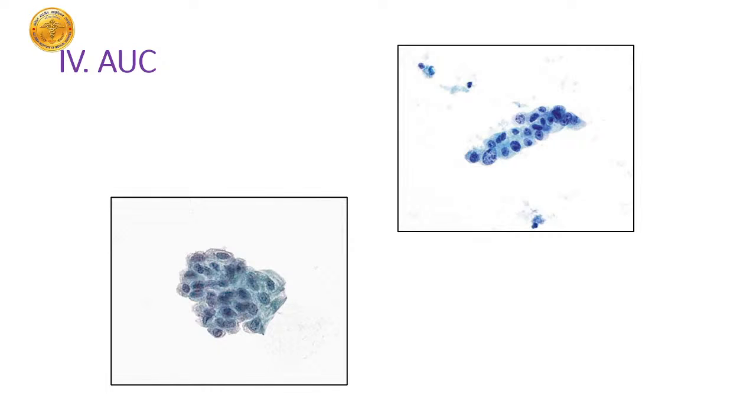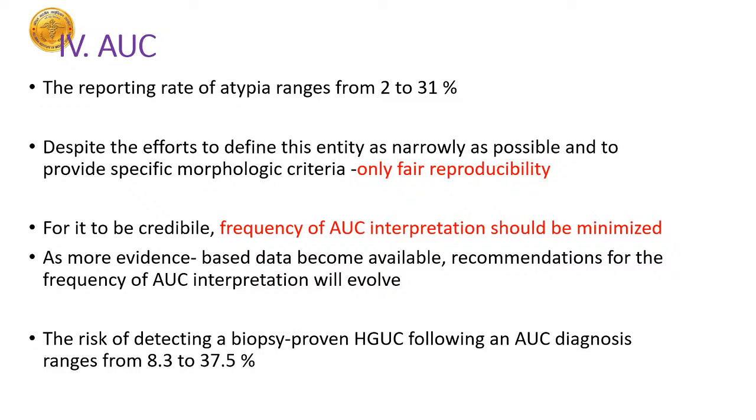Right, this is just to show you a specimen of degenerated urothelial cells. We cannot really make out the nuclear details, they are not very crisp. This is something they would call atypia of atypical urothelial cells. As we said, this nucleus is much larger. These are some prominent nucleoli, but the ratio is maintained. It is not really more than 0.5 in all of them. So these are some examples where this was a degenerated urine.